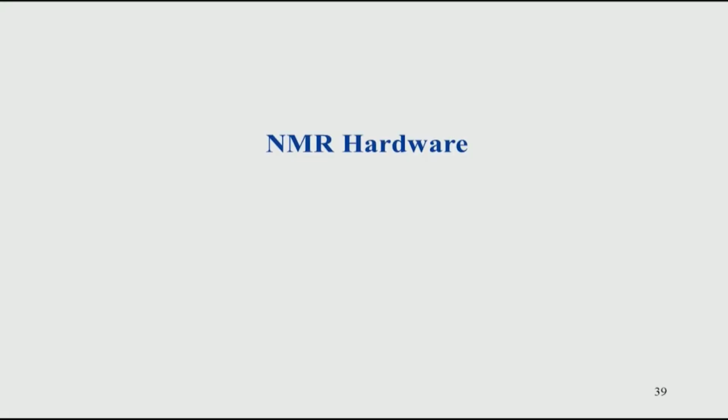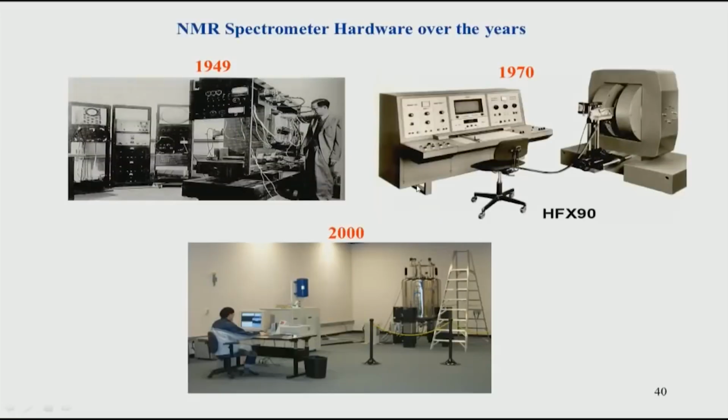So, today we will look at the NMR hardware aspects. We will look at how an NMR spectrometer is built, and what the different components of this system are, so that we get a feel of how experiments are performed.